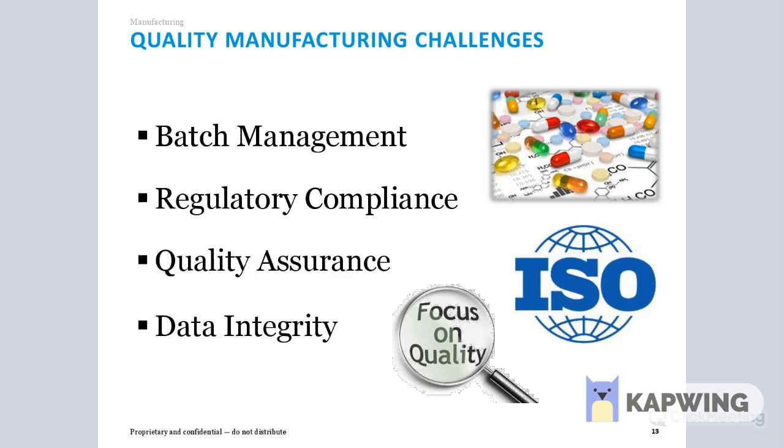Manual processes contain multiple points for transcription errors, which can lead to the need for inefficient processes to be performed to check for transcription errors. For example, when you're using a balance and you want to test that, you have to check that it's been transcribed onto the worksheet from a printout. It's also very difficult to prove that results were contemporaneously entered, and we'll talk about that in a little bit.